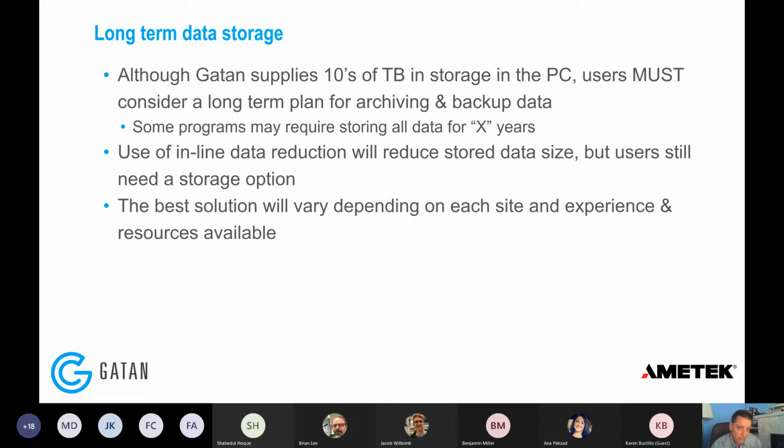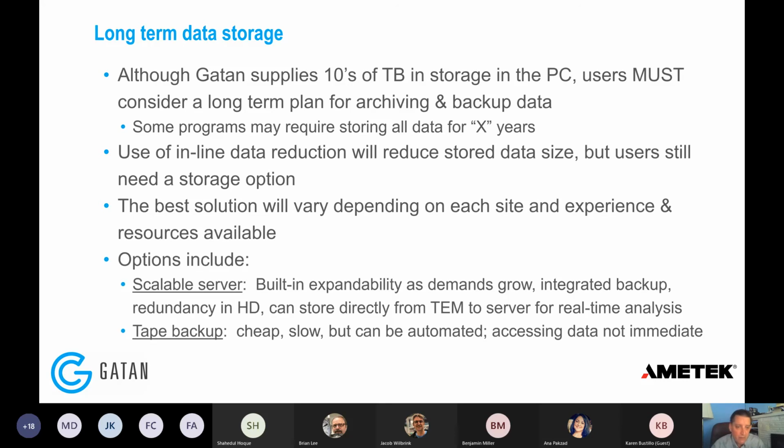So GMS can provide most of the answers, not quite everything yet, the reconstruction, for example. But the local scenario, depending on the experience people have with large data sets and the resources at the site, vary depending if it's a national lab or a company or a university, and even within those universities vary wildly. So caveat emptor for your solution. But we have worked with, and we continue to work with, individual sites to figure out what works best for them. Just a couple options.